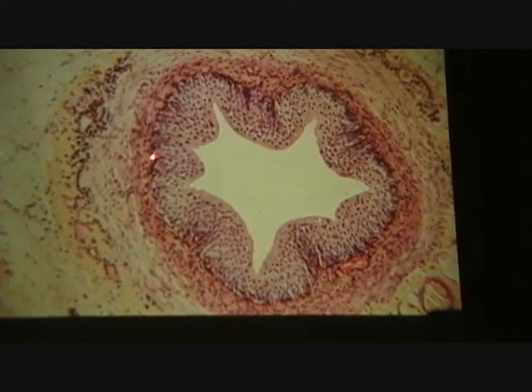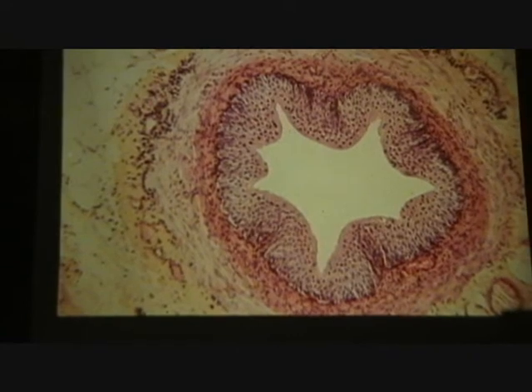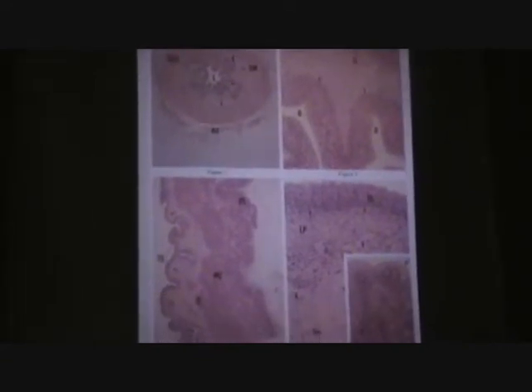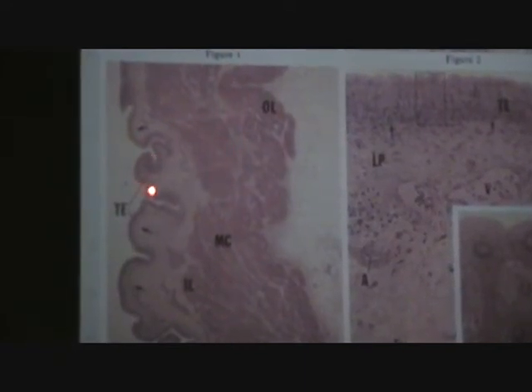As soon as you've made that identification, then it's just a matter of thin wall, ureter, much thicker wall, bladder, or vesicle. And that's what you see here in this comparison. Often with the ureter, we can get the whole structure on the slide. A nice little ureter right there. Whereas the bladder's so big, you just get a little segment of it. A little wedge-shaped area of it and say, yep, there's the big, thick muscle of the bladder, and then that transitional is just right in here.